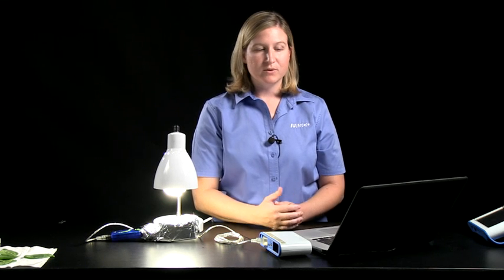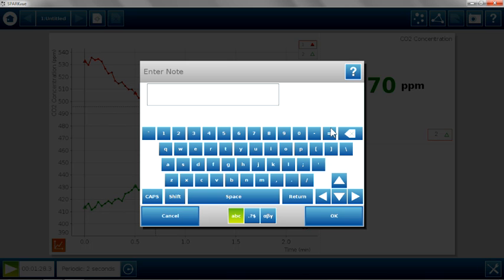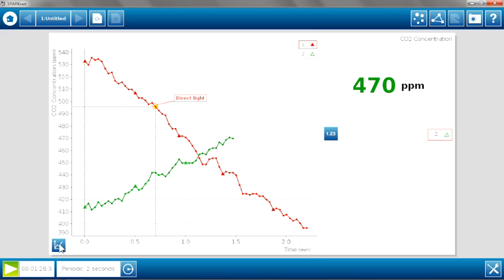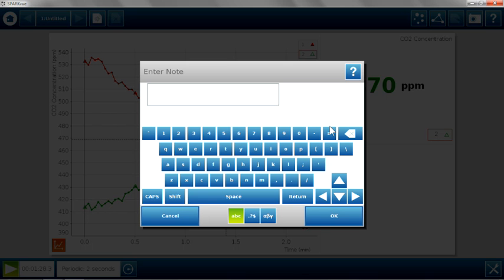Another tool that we can use, we can use the select feature, the arrow, to be able to select a part of the line and be able to give that line a label. So now that I've selected that line, I can open up a text keyboard and I can type in an annotation, something like direct light. And I could do the same thing for the darkness. For that, I would just need to come back to my key for the two runs, select run two, and now that I open up my graph tools, I'll be able to select the run two line and annotate that just like I did for one run. So I'm going to label this one darkness.